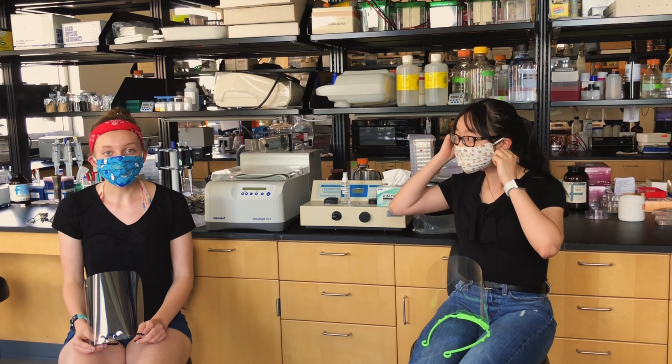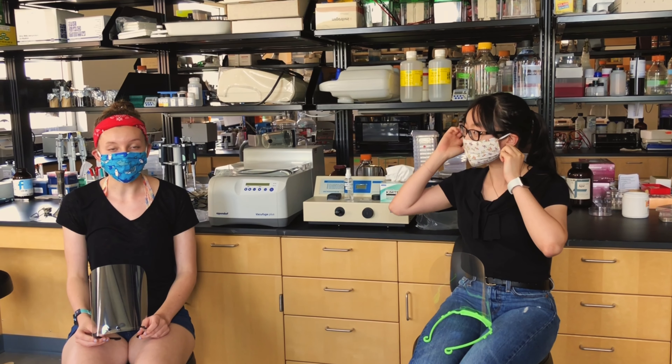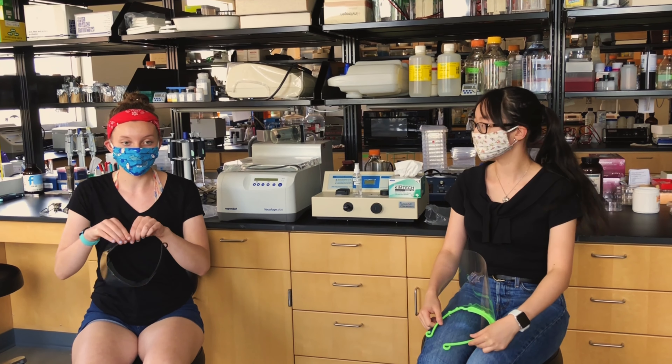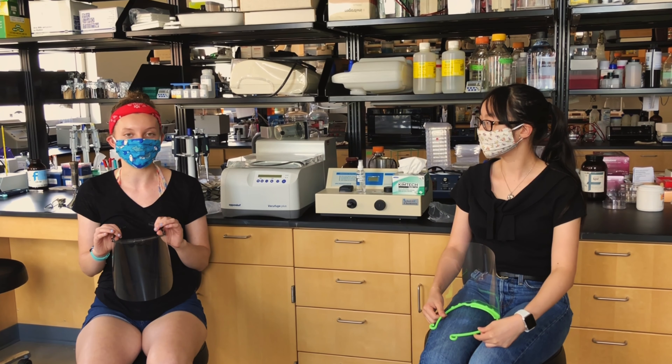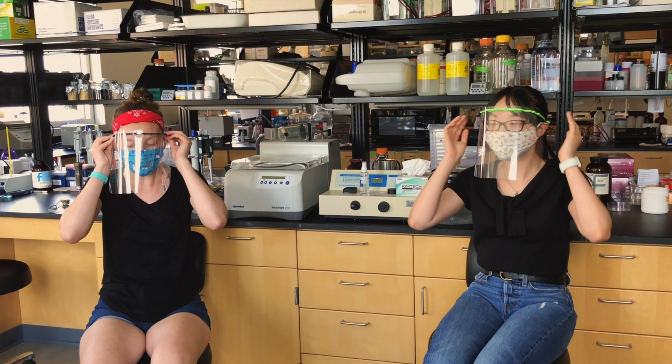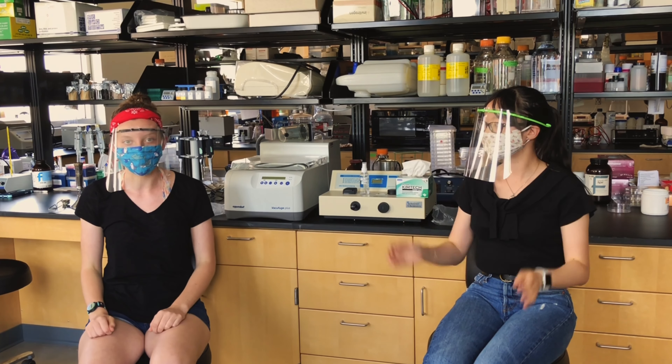When you first exchange your mask for a face shield, make sure that your face shield is on before you touch your mask. That makes sure that we don't put any germs into the environment. So start by putting on your face shield. Make sure that it sits about the middle of your forehead and covers your entire face.